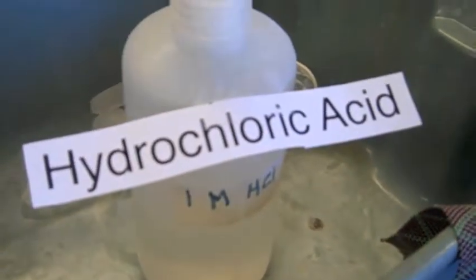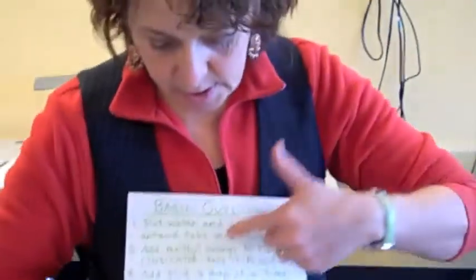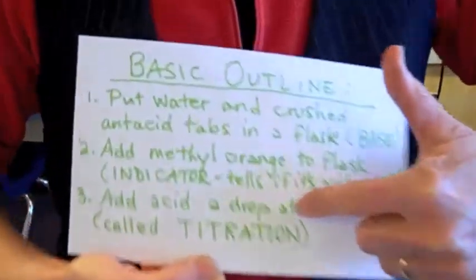There are three terms in this lab that are important, and you're going to need to make sure that when you write up your lab report that you include those terms. Those terms are titration, I'll come to that in a minute, neutralization, and an indicator.